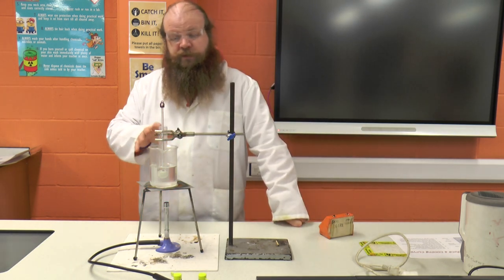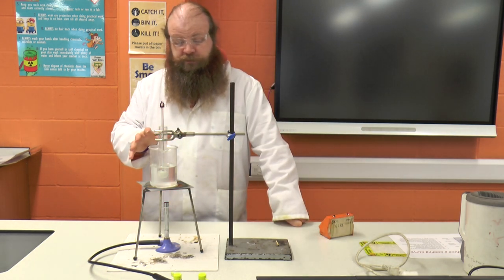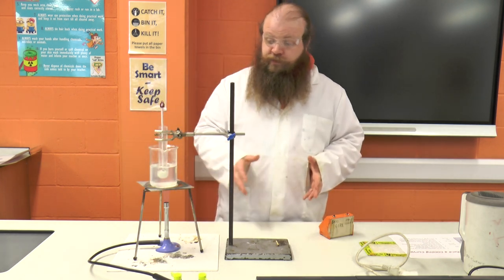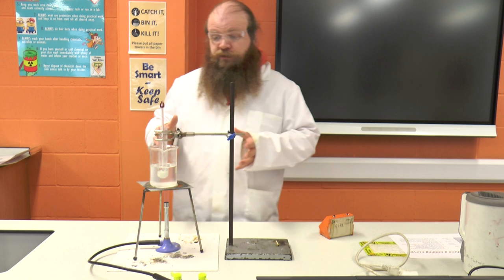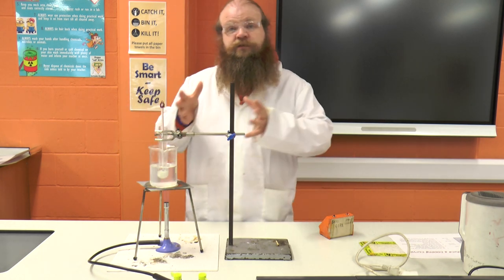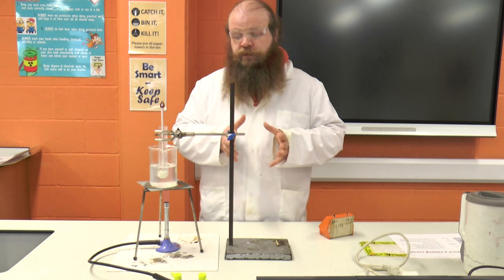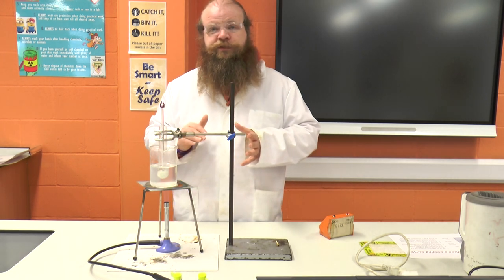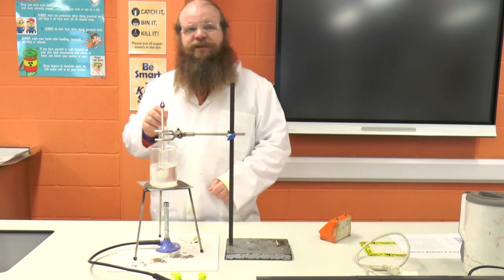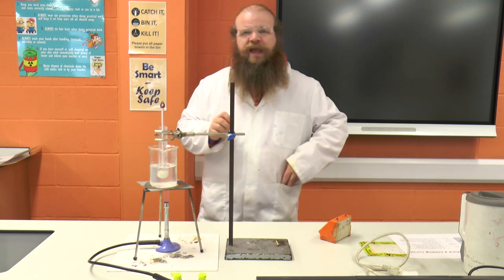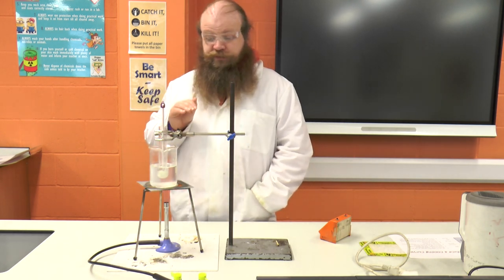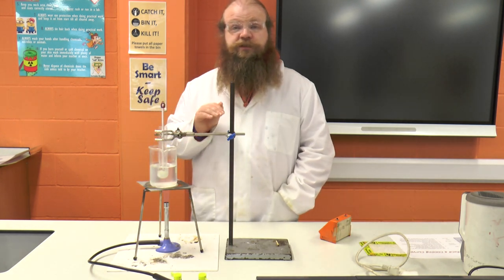While we're waiting, we can be drawing up a table for our results. Once we've got the stearic acid melted, we're going to take it out of the boiling water and measure the temperature. We're going to start our stop clock and then take a reading of the temperature from the thermometer every 30 seconds until we get the temperature down to 40 degrees C.